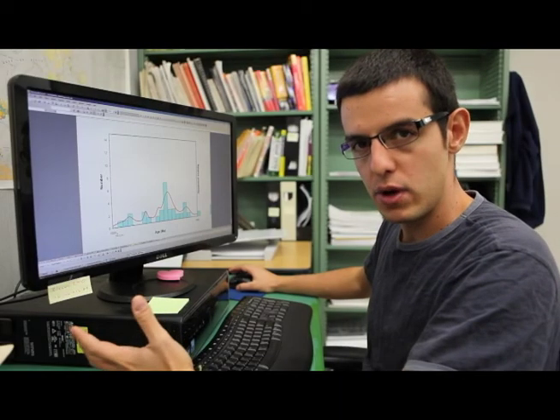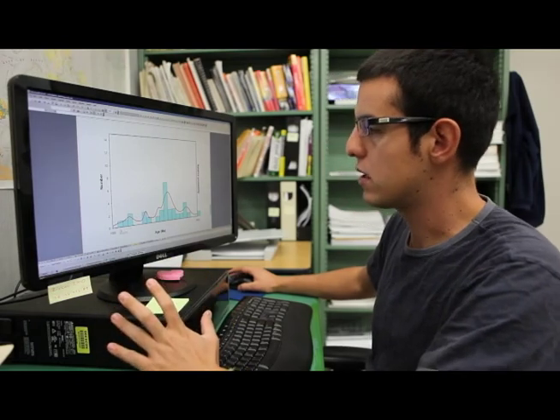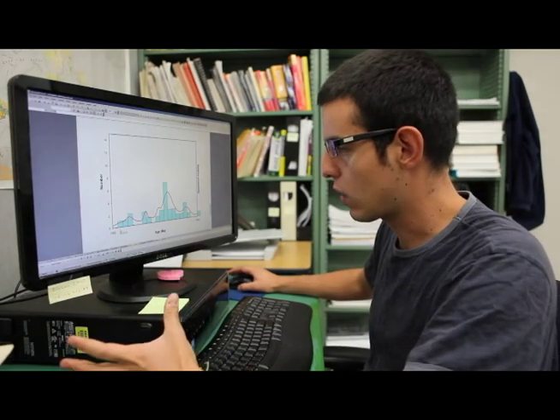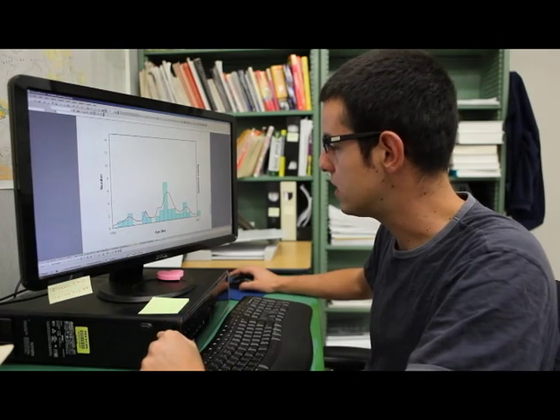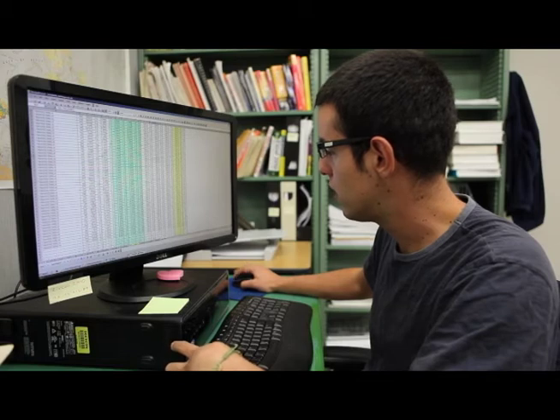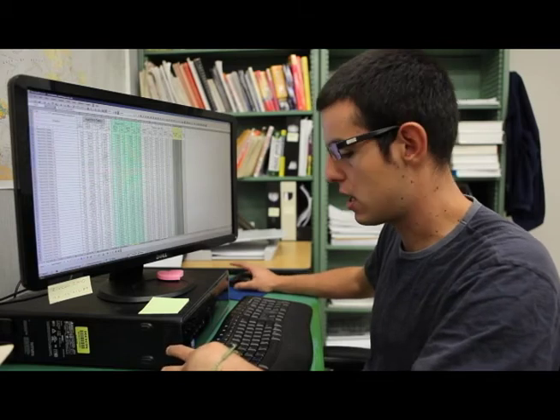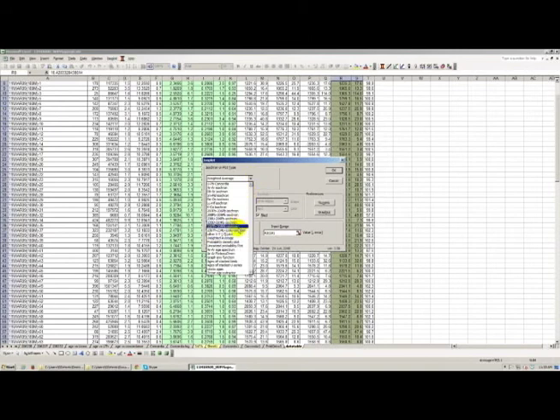One last thing to note, when you're making the final plots that you're going to take to another program and edit to make the final figures for your publication, is that you've got to realize what happens when you do a probability density plot that does not have a filled histogram. I'm going to do one here right now.